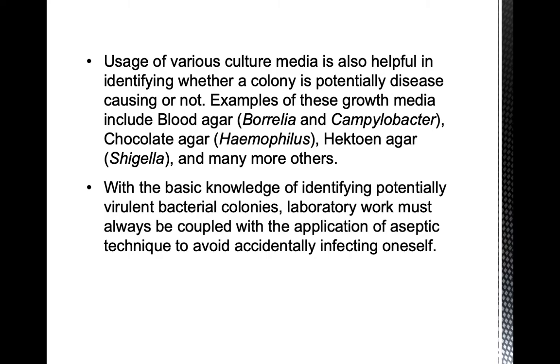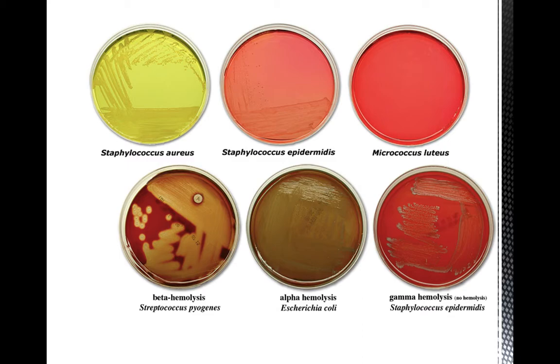Okay, so those are examples of culture media we can use in order to identify a potentially disease-causing species. Now, with a basic knowledge of identifying potentially virulent microbial isolates, laboratory work must always be coupled with the application of aseptic technique in order to avoid unnecessary infection. Now, I think this is an example I have to show you, the use of certain culture media. We have here this one on the top panel.